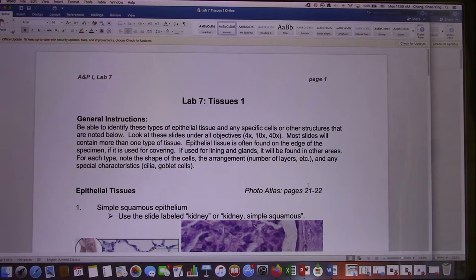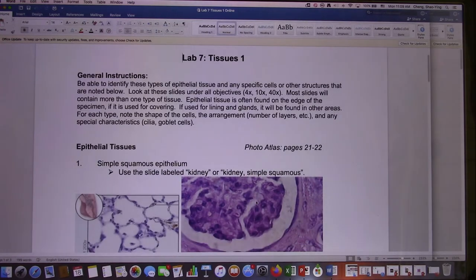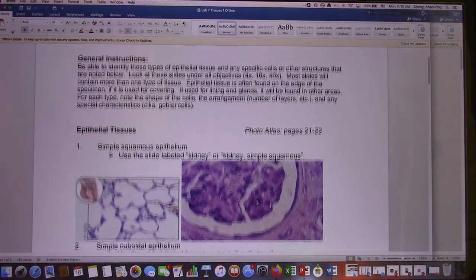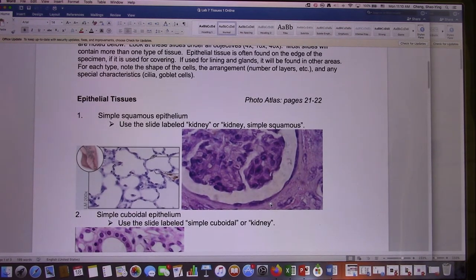We're in Lab 7, Tissue 1. In this lab you need to identify the different kinds of epithelium tissue. I will give you a slide and you need to be able to tell me what kind of epithelium tissue it is.